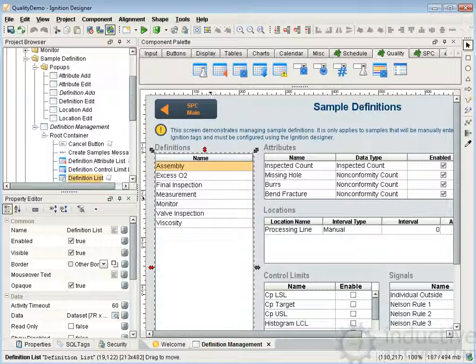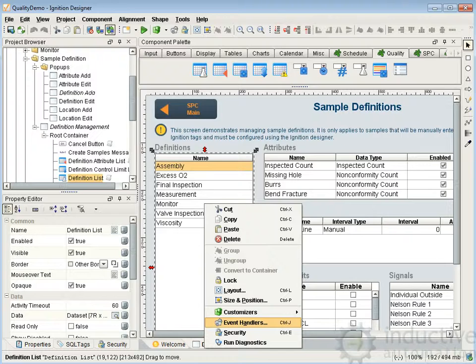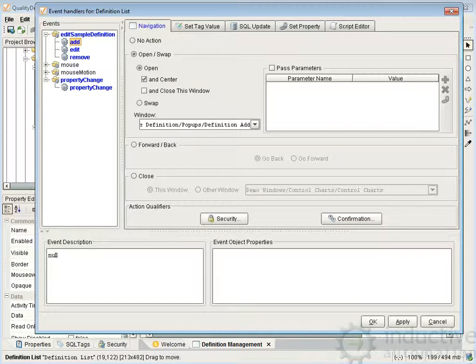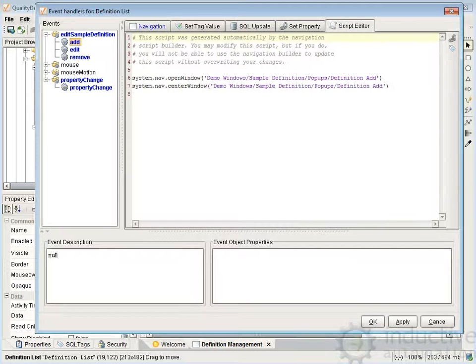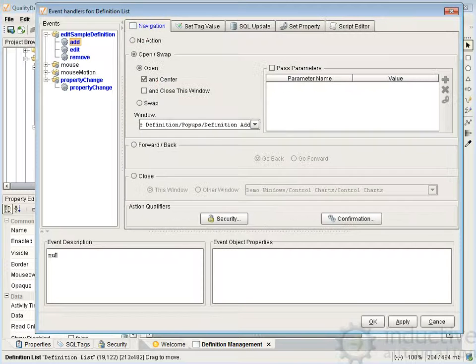Next we're going to take a look at dealing with adding the definitions and dealing with the pop-up. If I select the definition list, right-click, click event handlers, we see we have 'edit sample definition category' here, and we have add, edit, and remove. When you put script in here, those menu items will show up. For add, it's pretty straightforward — we're just navigating to the pop-ups.